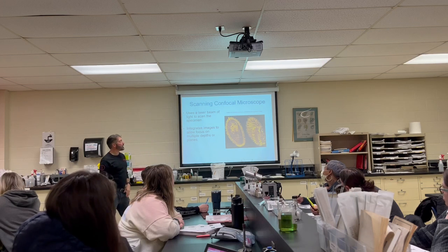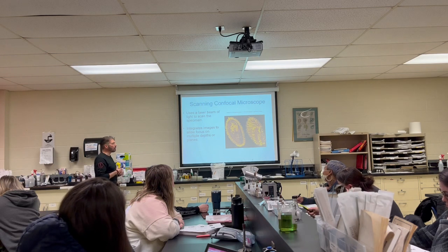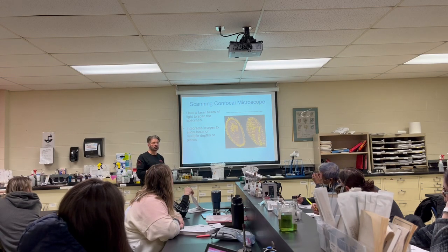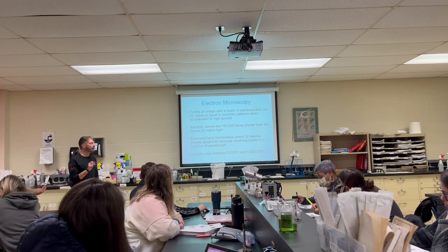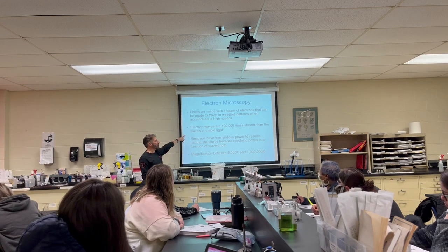And there's a scanning confocal microscope. This bounces off the object, sort of like sonar, you know how sonar works? You bounce things off to get an idea, similar to that. And if they ever ask you, the most resolving power is the electron microscope, because we changed the wavelength.